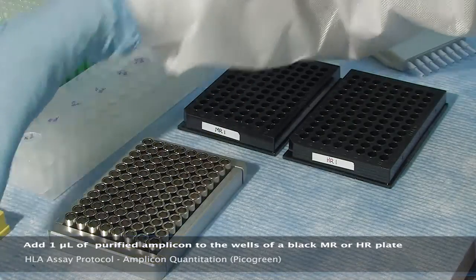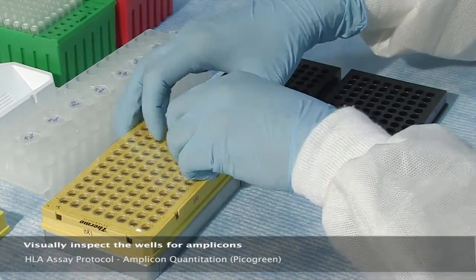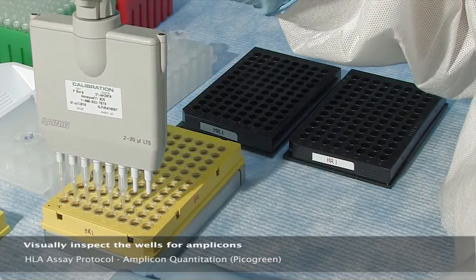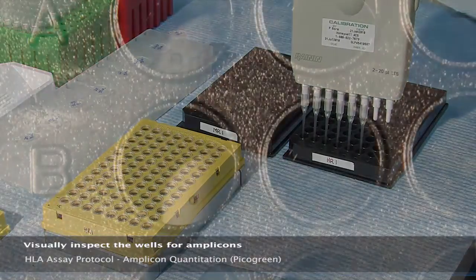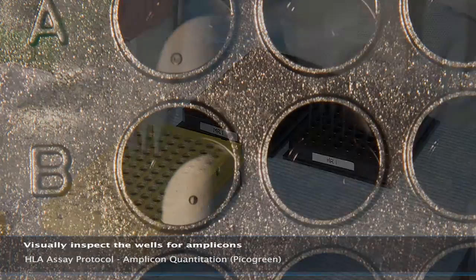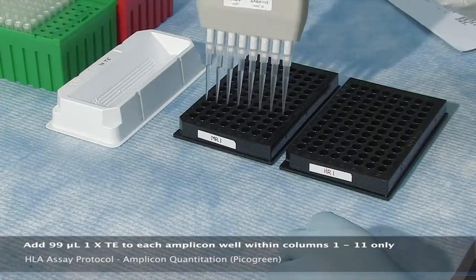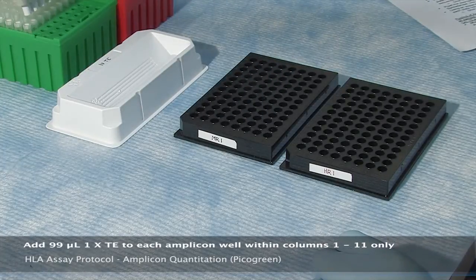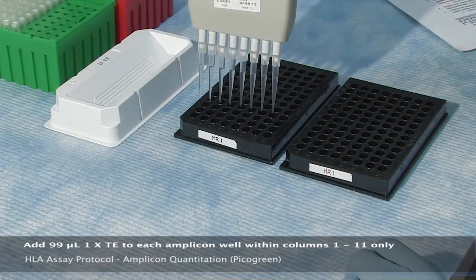Using the magnetic plate stand minimizes the risk of transferring the magnetic bead carry-over. Carefully inspect the wells visually to ensure that all amplicons have been pipetted. Please refer to the photo being displayed for an example of what you can expect to see. Next, add 99 microliters of 1X TE to each amplicon well within columns 1 through 11 only, since column 12 already contains the standard.